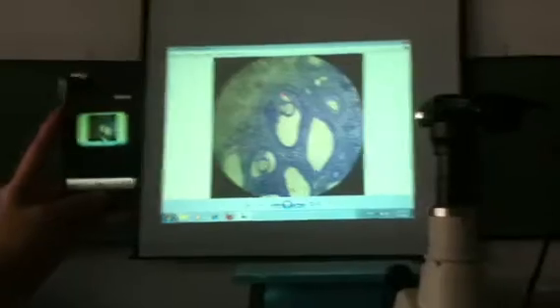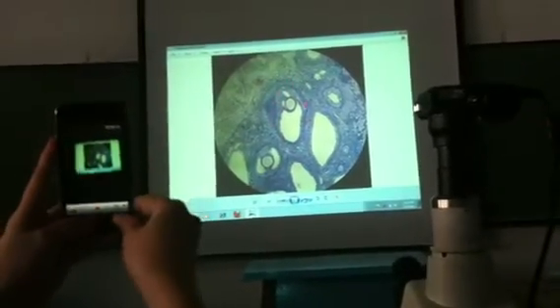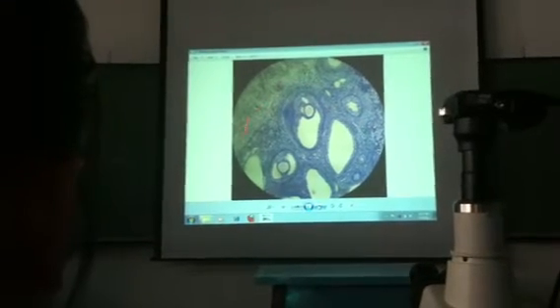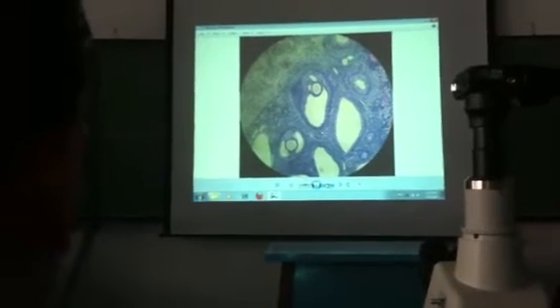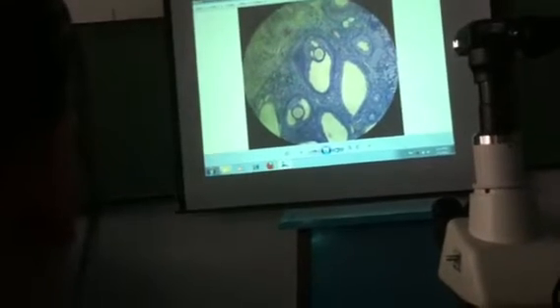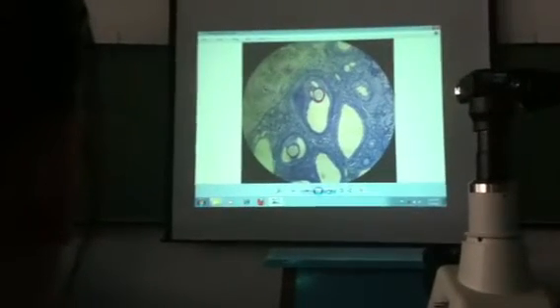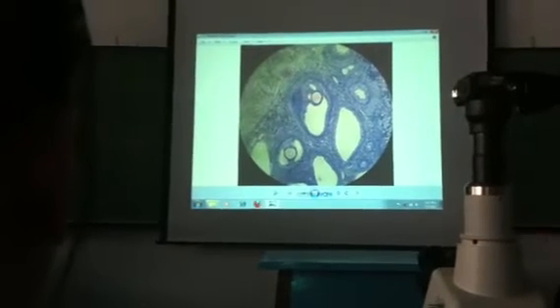All of these are cells. Cells, follicular cells, making up the follicle. These are cells. All of those are cells, but they're too small for you to study. Even these are cells of the connective tissue. You have primordial cells there, which are too small for you to study. That is the reason why we are asking you to concentrate on this cell. This large cell is the ovum. So the ovum is not the ovary. We are asking you to look at that.